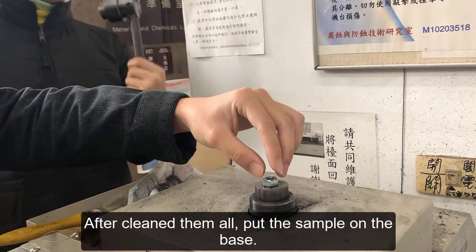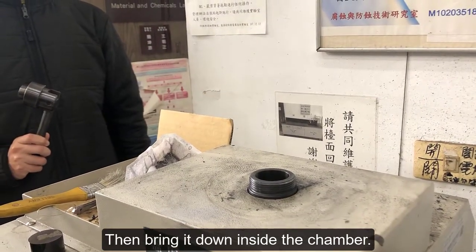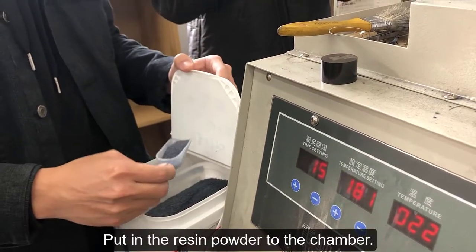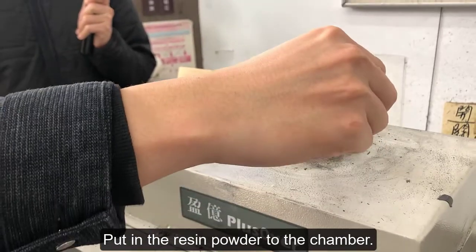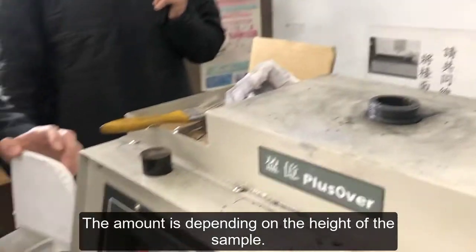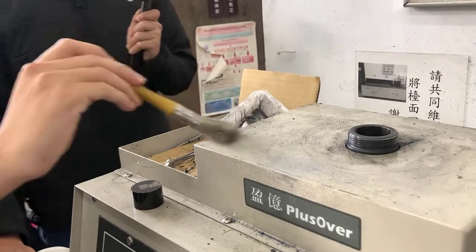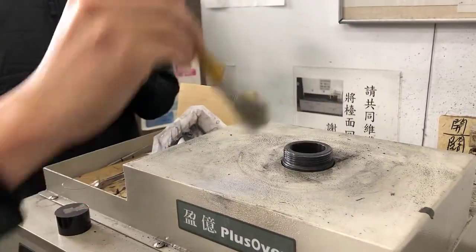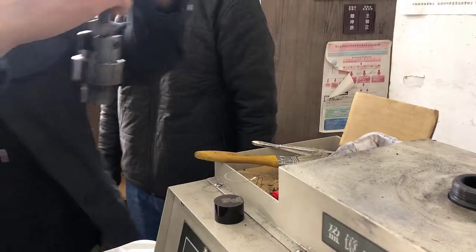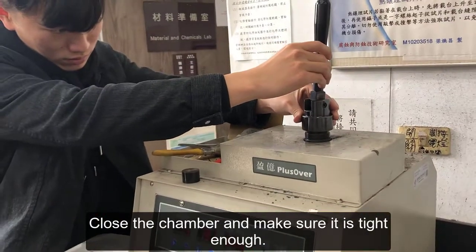After cleaning, put the sample on the base, then bring it down inside the chamber. Put in the resin powder into the chamber — the amount depends on the height of the sample. Then close the chamber and make sure it is tight enough.